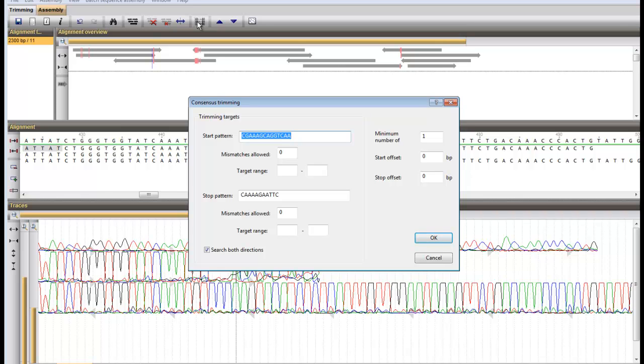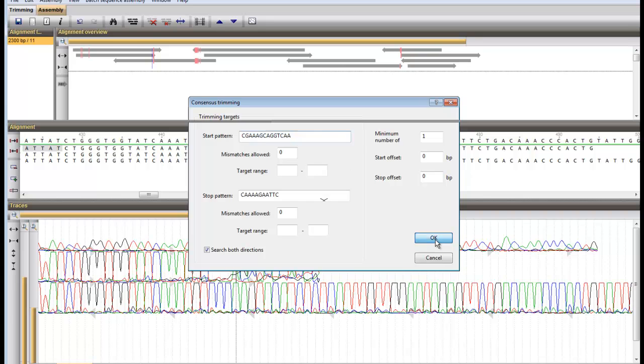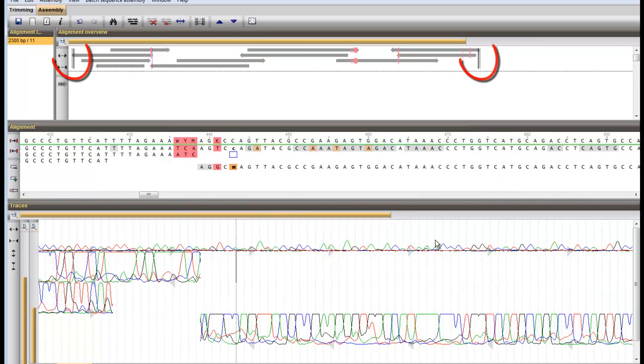And thus to be left out of the consensus sequence. I click OK and the trimming ends are indicated on the graphical overview.